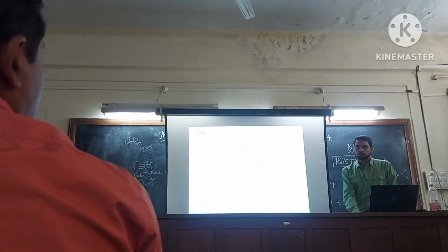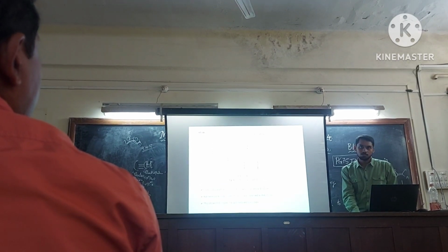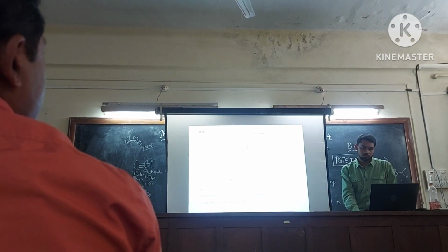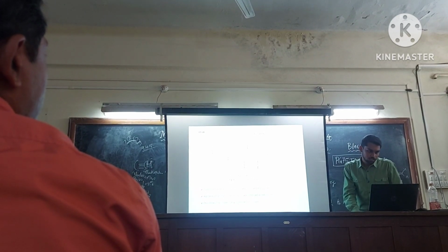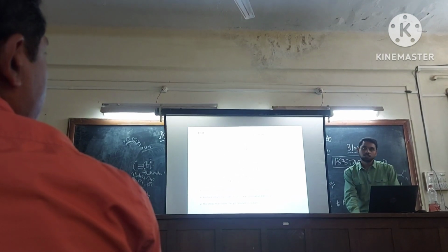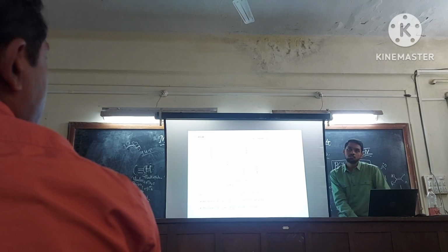Now this is IR. Looking into the transparency, it is around 65%, 60 or 70% transparency. Is it? The rest, 45%, only 45% absorption.